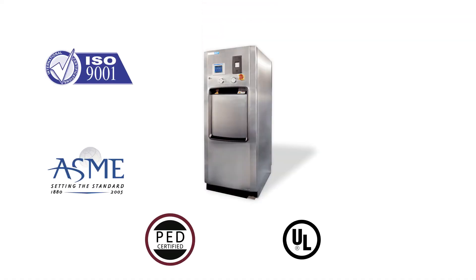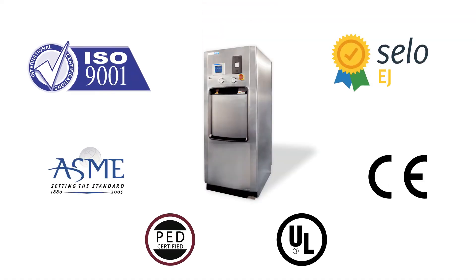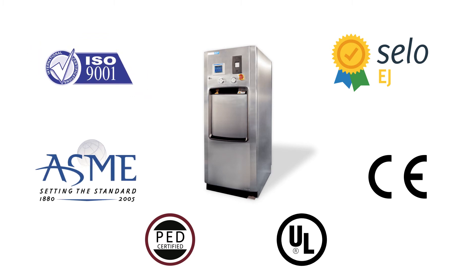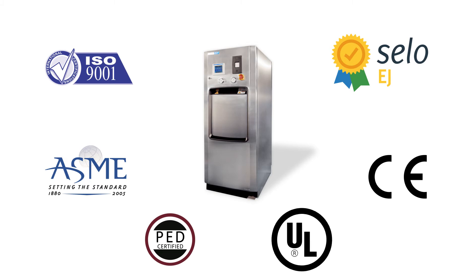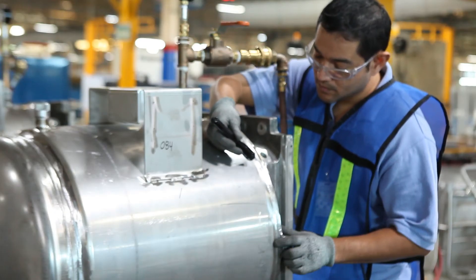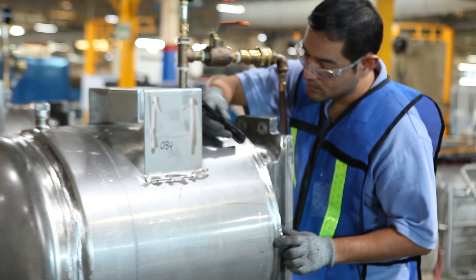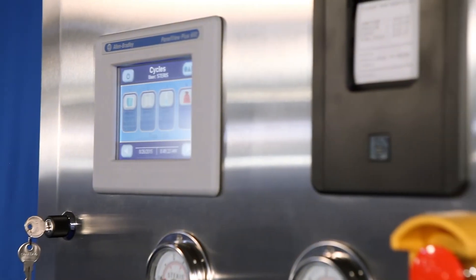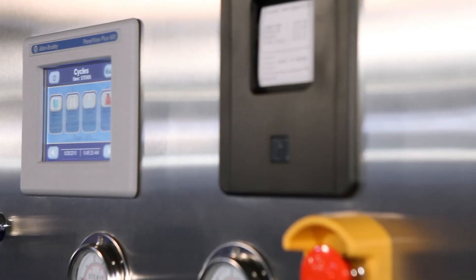The AMSCO small LS series is manufactured in an ISO 9001 certified facility and is tested to conformity to ASME, PED, UL, CE, and CELO. The chamber and jacket are manufactured with 316L stainless steel for maximum corrosion resistance and greater durability.